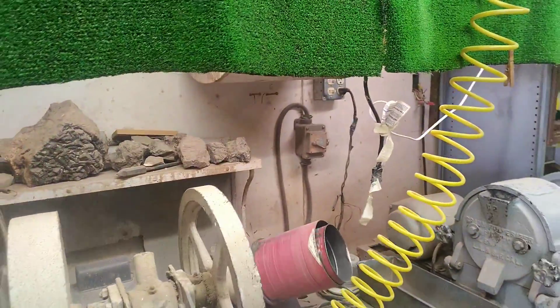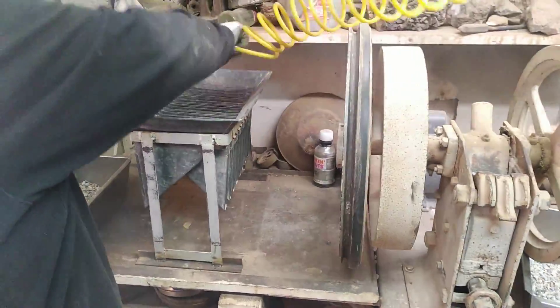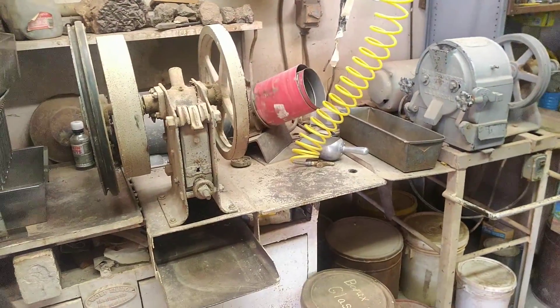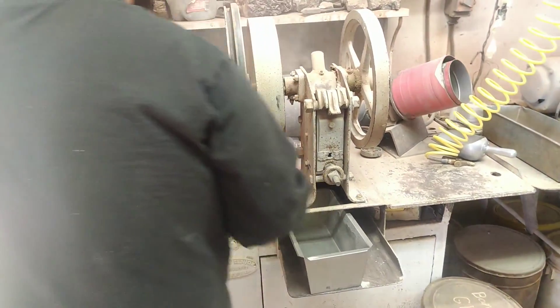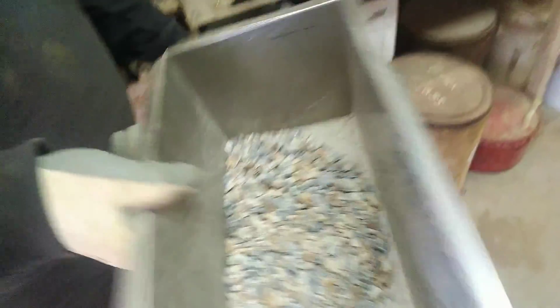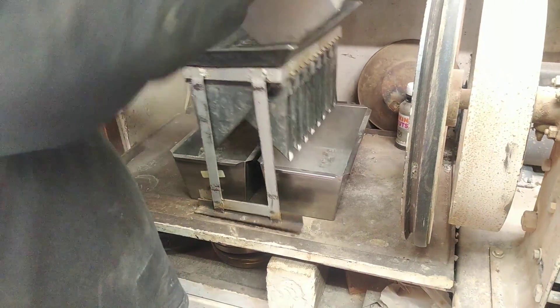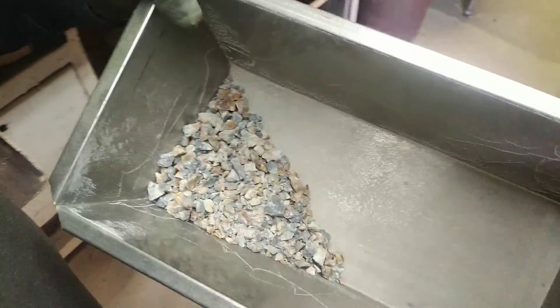We've got a fume hood in here to deal with the dust, and everything is blown off to minimize cross-contamination. That's about how much we put through the pulverizer — this is what's actually going to go through the pulverizer and then be fused.